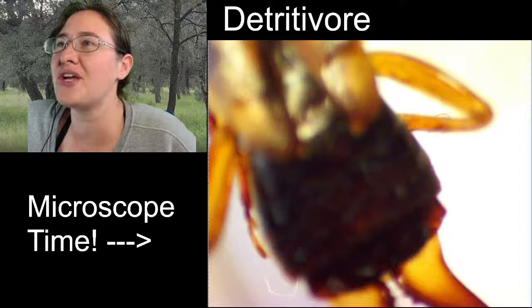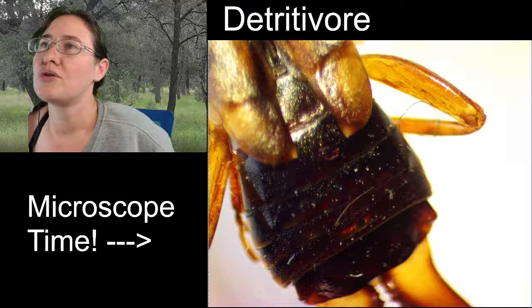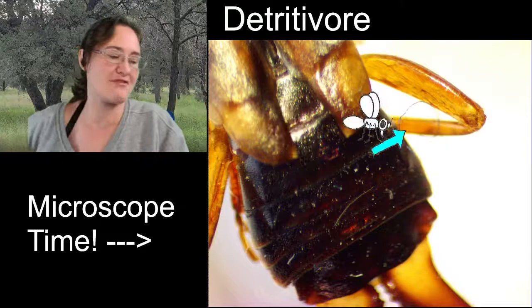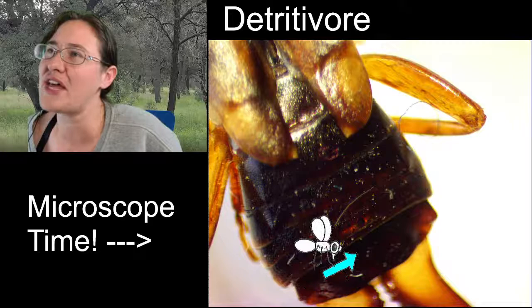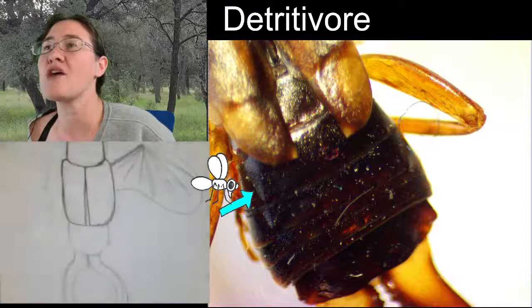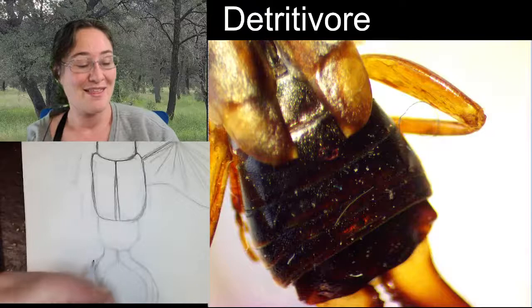Segments to see how many are after our elytra. Now, let's see. This one is underneath the elytra. This one is going to be the first one visible, and it's only halfway visible after the elytra, but that's okay. So this one's going to count. We're going to count this one as 1, 2, 3, 4. It looks like approximately 5 segments after the elytra for our sketching purposes. There are more than 5 abdominal segments on our friend here, but the rest of them are underneath the, I keep saying elytra, I mean tegmina. The other ones are underneath the tegmina.